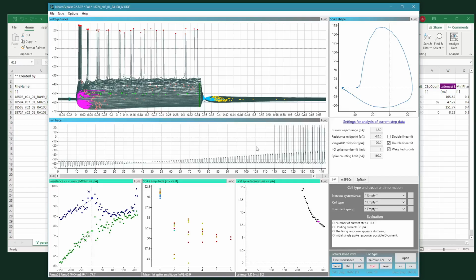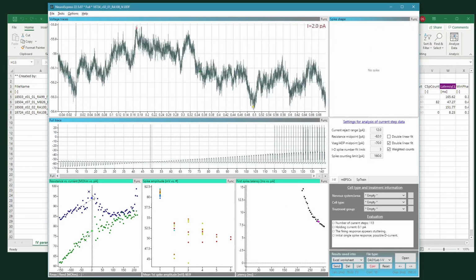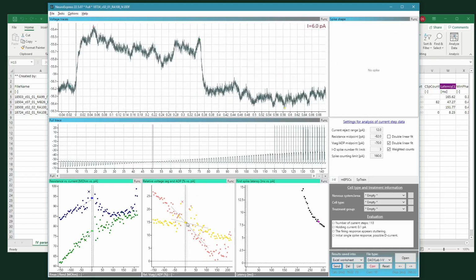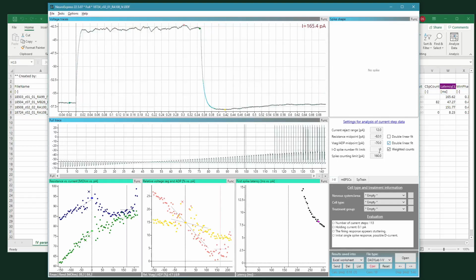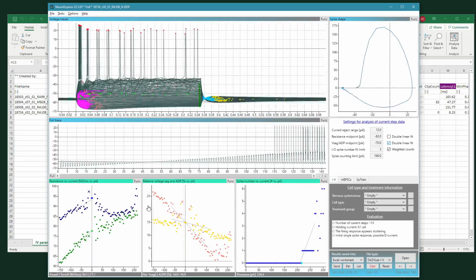The program will not wait for user input and instructions to calculate these parameters. Basically it will just do it automatically, but of course you might want to change the settings, and the slopes and these midpoints or the linear fits, spike counting limit, etc., in order to get the best estimation of the physiological parameters for the particular cell type or the cell that you recorded from.